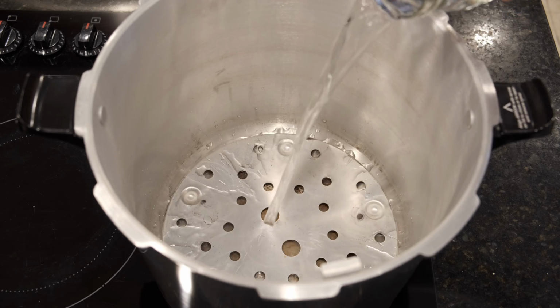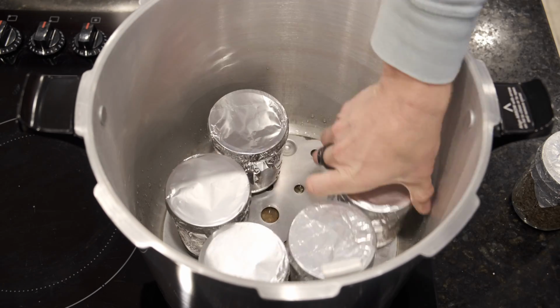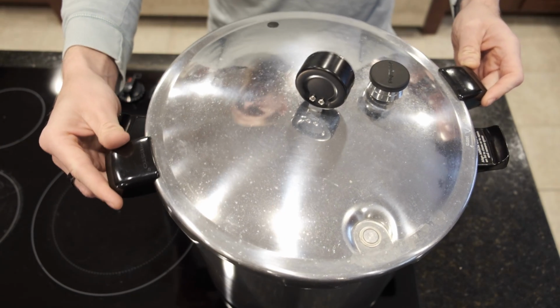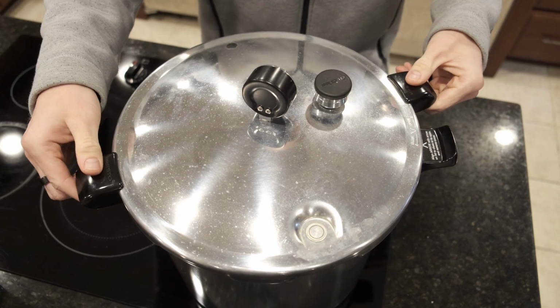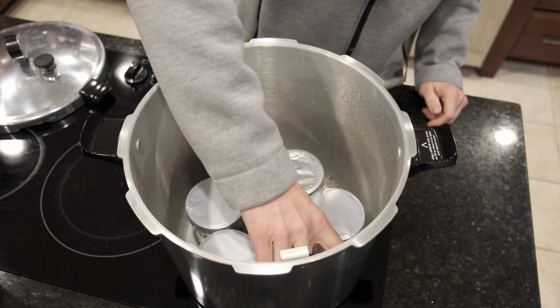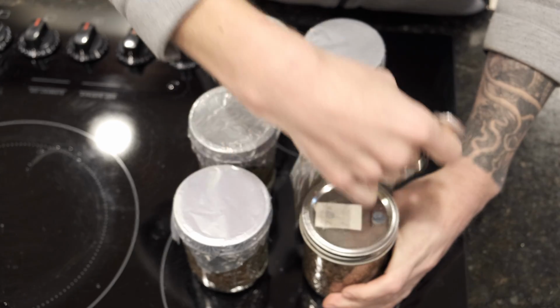Now it's time to load everything up into the pressure cooker. Make sure you add water in the bottom first. Install the cover and pressure cook at 15 psi for 90 minutes. Wait until the pressure cooker has fully cooled before removing the jars. And then allow the jars to cool to room temperature before inoculating.